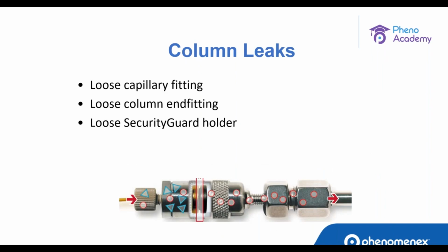Column leak. If we are facing column leaking, here are the major areas causing those column leaks. First is a loose fitting. Second is a loose column end fitting. And the last one is a loose SecurityGuard holder.